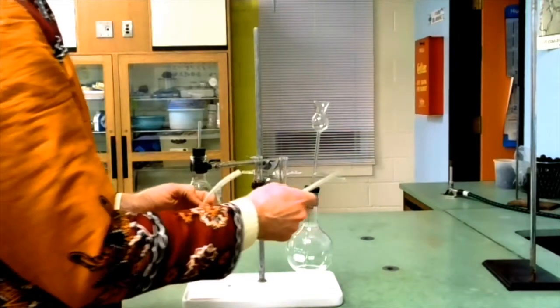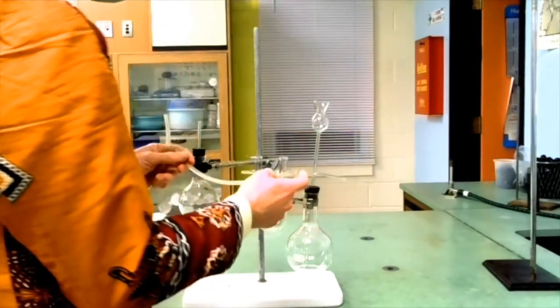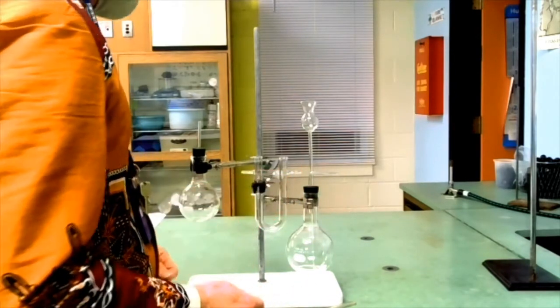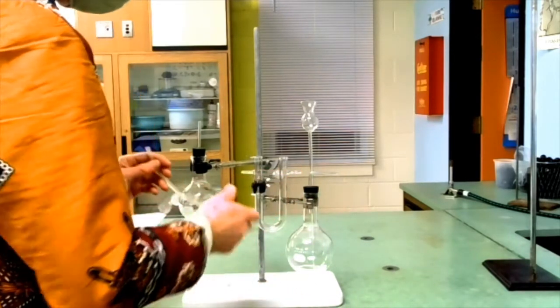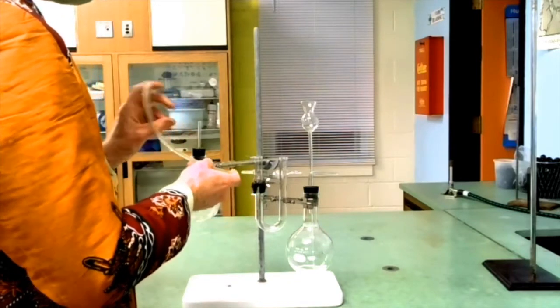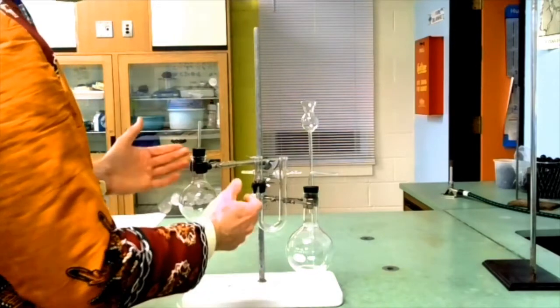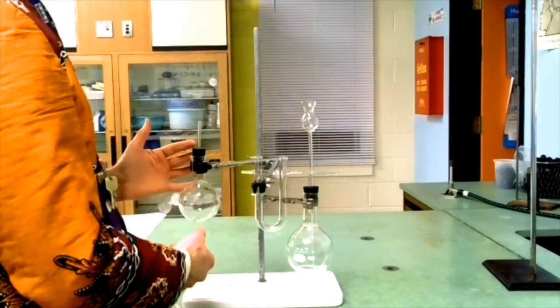Then I'm going to connect the tubing from the output from the gas generator tube to the input to the drying tube. And then the output from the drying tube to the input to the gas collection flask.